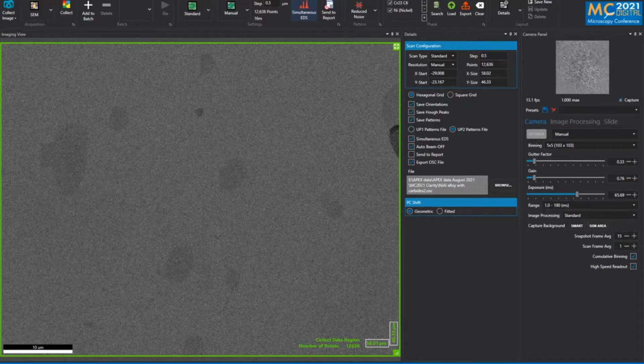If you have a heavily deformed material, then it also depends on the microscope, how narrow the beam can be. But on most field emission microscopes, you would work somewhere between 5 and 10 nanoamp. And on the Clarity, I would work below 1, because as we saw before, when I'm at 2.5, 3 nanoamp of beam current, then the detector easily oversaturates. So that's already too much for what I need. Okay, thank you.